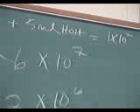And then you take from that 1 mil plus 9 mils of water. That will give you 1 times 10 to the 6. If I do it again, that will give me 1 times 10 to the 5th, and that's what you want. What will I do to this one?